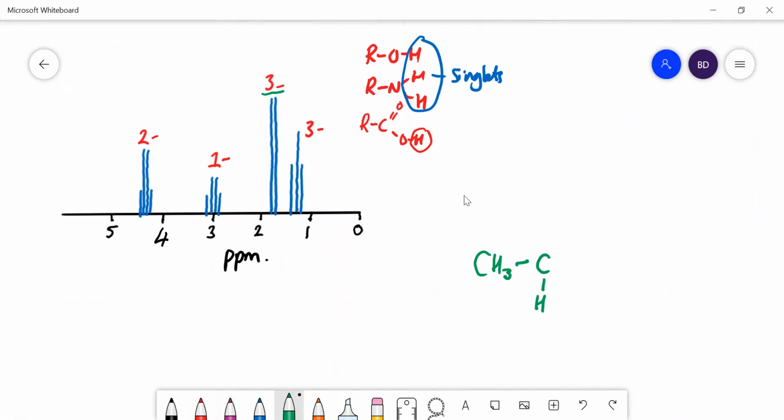So at these positions here and here, you can't have a hydrogen there. Now, one of them could be another carbon. We've got 6 carbons to think about, so let's put a carbon down for one of those. We have something attached to that.